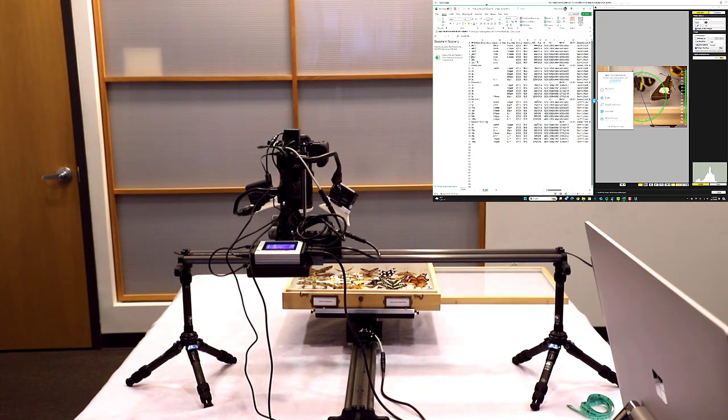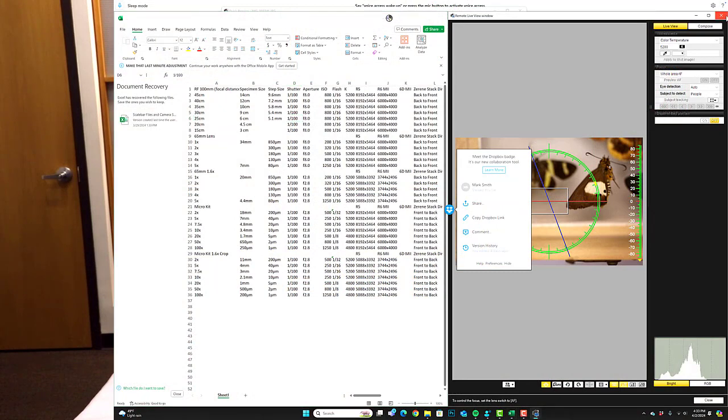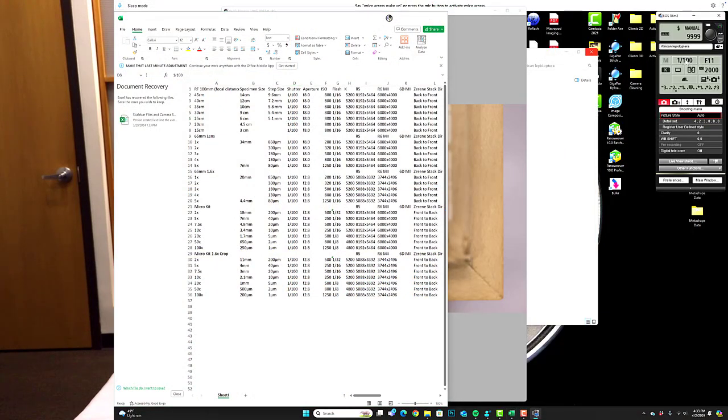So at this time, you'll navigate over to the left, find the 25 centimeters. Our shutter settings are here. We're going to close our remote live view window. And on our EOS remote, we're going to select the shutter speed, which is 1/100. We don't need to change that. Aperture is f11. We don't need to change that. ISO right now, I have it set to 2000. Up here I have it at 800, but I know that I have my flash setting around 1/16. So we'll just see what 2000 is.